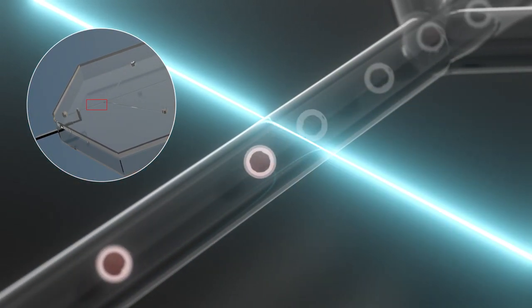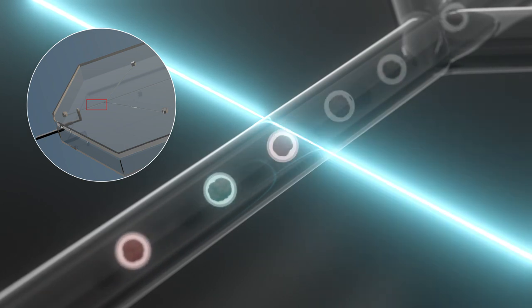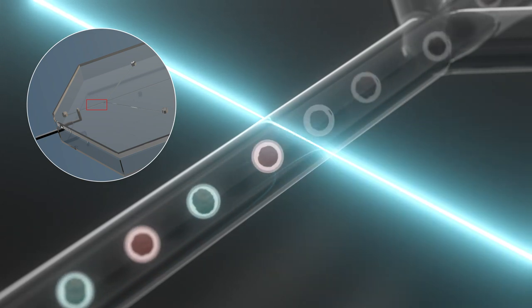Individual cells passing the laser spot are then interrogated and measured via detection channels.